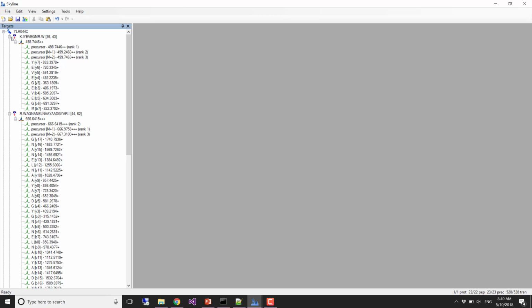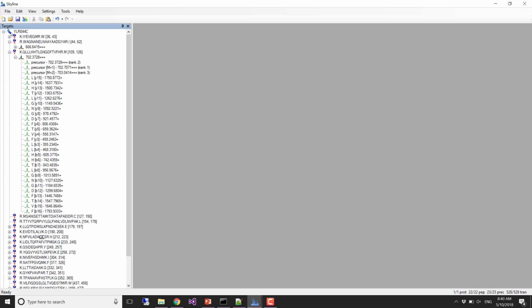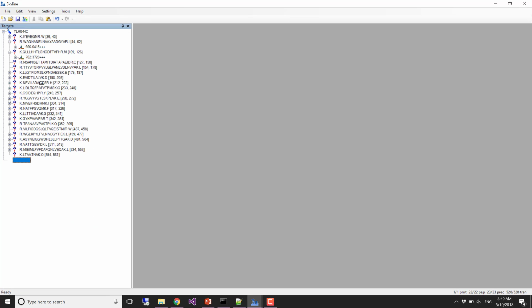That's charge 2. And so why not charge 2 here? Does anybody know? Why am I limited to charge 3 precursors? And even some of these really longer ones, I can't even get anything. We don't have any prior knowledge about it. Yeah, somebody got it. Who said outside the range, right?